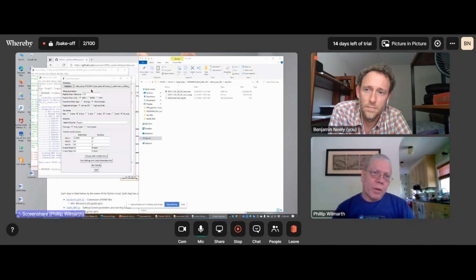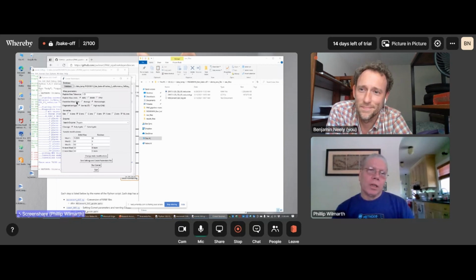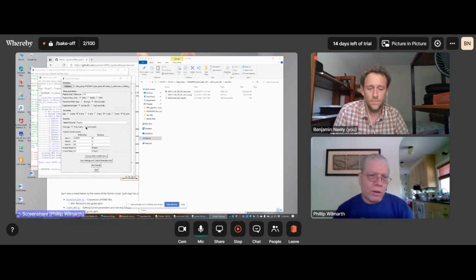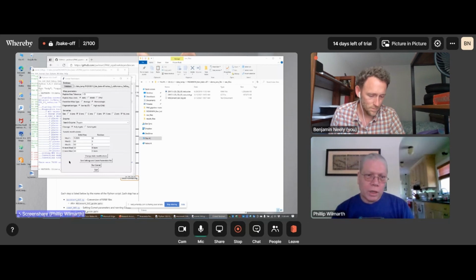That's there. In the pipeline, we do wide tolerance searches, and I'll talk about that when we're looking at the delta mass histograms. Here, the data was actually done with high resolution MS2s, but we're going to leave this demo at low resolution because that runs faster. The enzyme is also semi-tryptic, which is a better choice for identifications, but that also takes a lot longer to run. So we're going to leave that as fully tryptic here just for demonstration purposes.